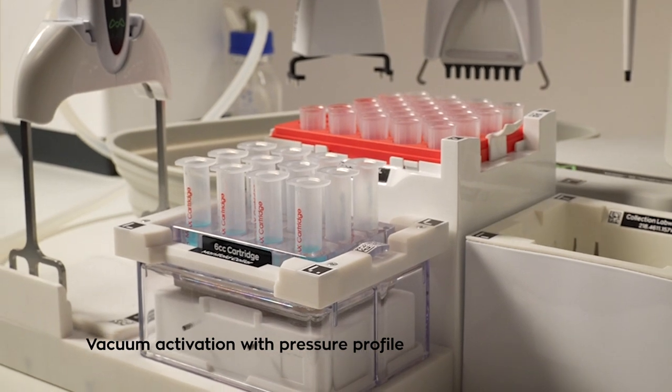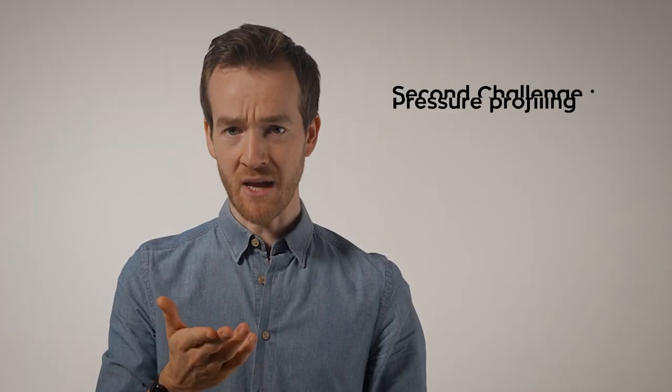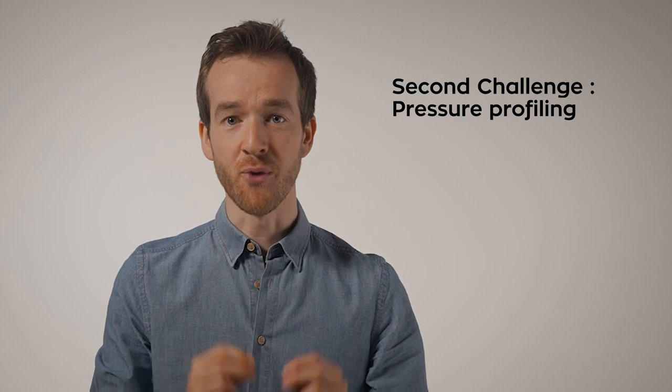The next top requirement: pressure profiling control. Matrices aren't always very cooperative when it comes to passing through extraction labware, and some may need a bit of an extra push, or pull, as it were. We found that a single pressure setting is insufficient for ensuring the full pass-through of all liquid at each step.